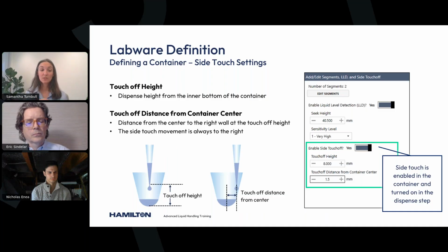Now, this is most applicable when the following step is a large volume bulk diluent dispense, or the plate's coming offline to centrifuge or vortex mix, because in this case, there may be some residual liquid on the side of the well where you dispensed. Now, once you have all these options, they're not always the best case for every situation, but they are great tools in these specific cases.